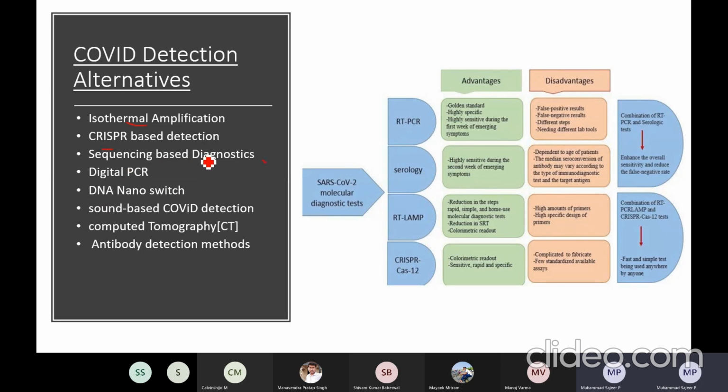And nowadays we have sequencing-based diagnostics. Nanopore is one of the interesting technologies helping us with sequencing-based diagnosis. What we do is we send the DNA, or whatever we want to sequence, through the nanopore, and we measure the current, and depending on the changes, we are able to see what is actually moving through the nanopore. Is it a T, G, C, or like that.